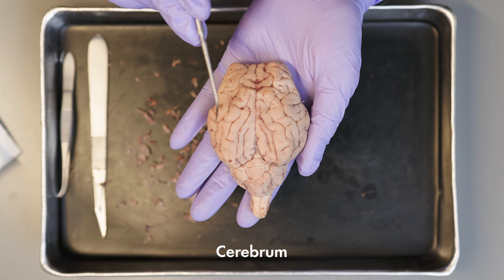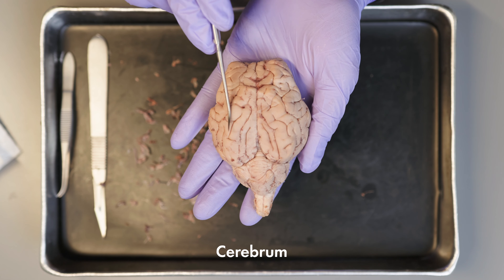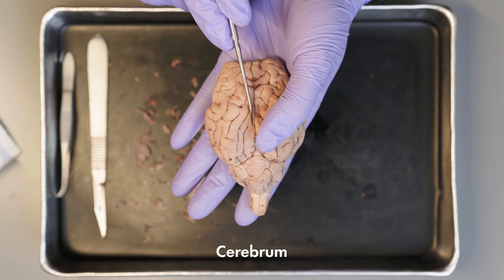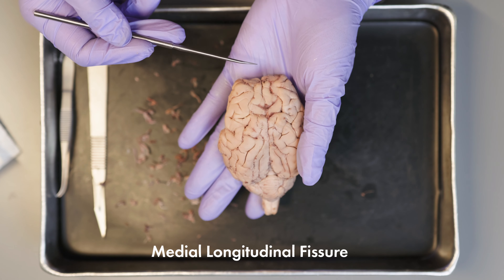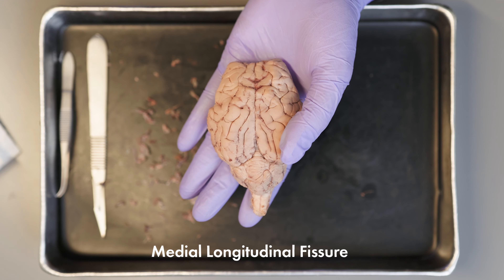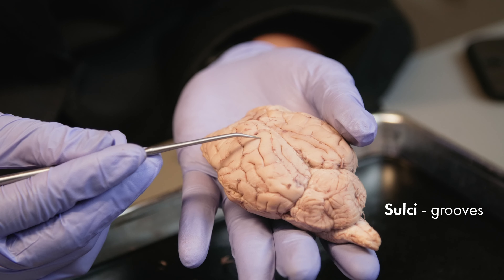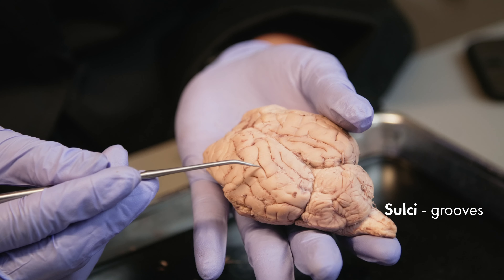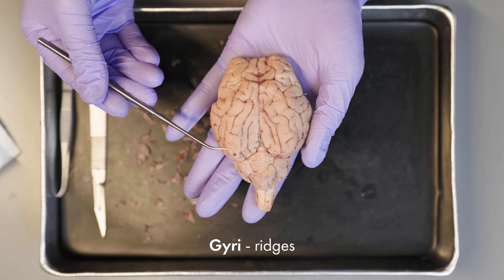Underneath the layers, we will find the cerebrum. The cerebrum is the largest portion of the mammalian brain and is divided into two hemispheres by the medial longitudinal fissure. On this cerebral surface, you will see the grooves known as sulci — plural of sulcus — and the ridges that are called gyri, the plural of gyrus.